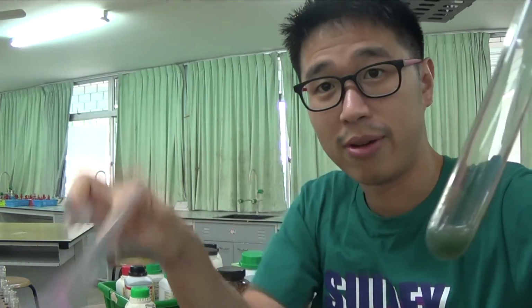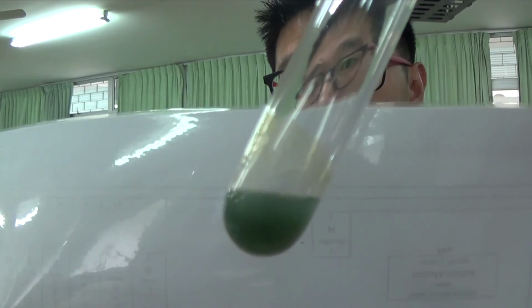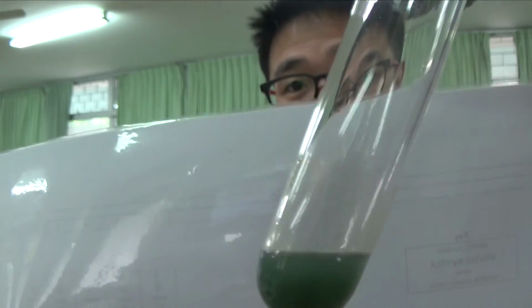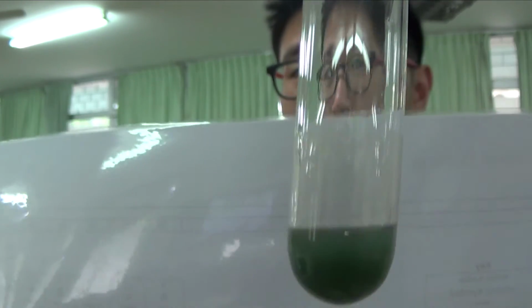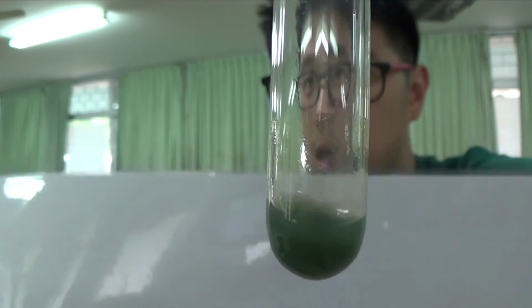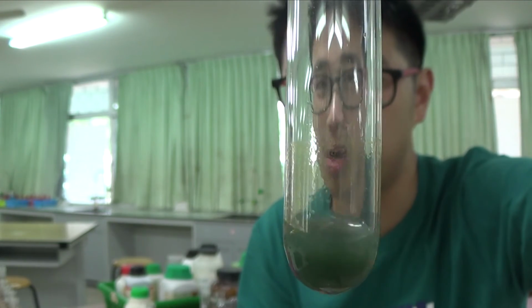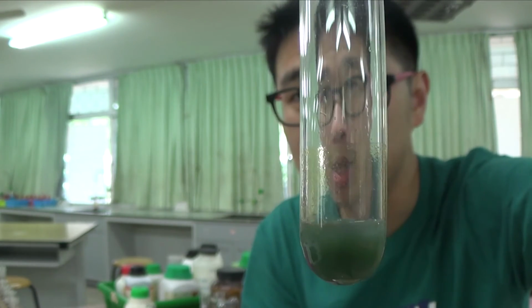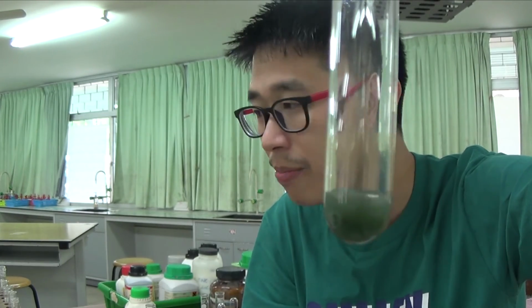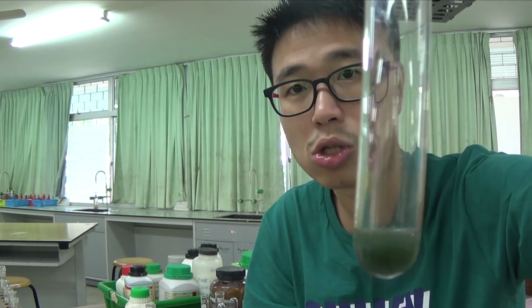If you cannot see color very well, get a white background, use a white tile or something. So I've just purposely shaken it on the side. I want you to see roughly what happened. This was in sodium hydroxide, so you get a precipitate because you cannot see through. You get a green precipitate. But in your qualitative analysis, you know that a green precipitate could also mean the presence of chromium 3, because chromium 3 hydroxide is also a green precipitate. That's why we need to add excess sodium hydroxide to make sure what is going on.